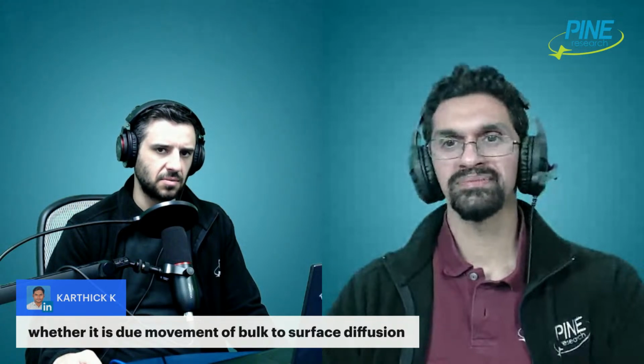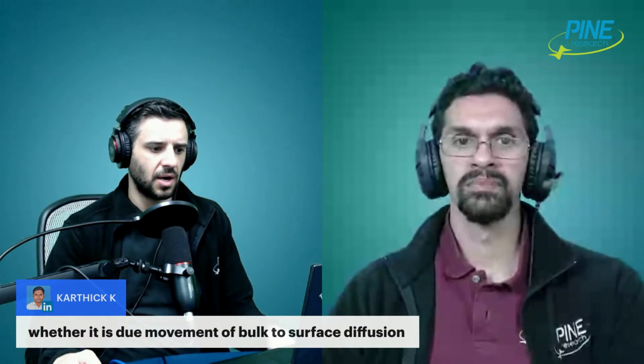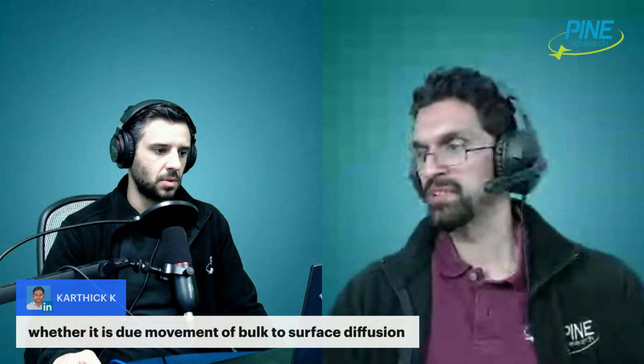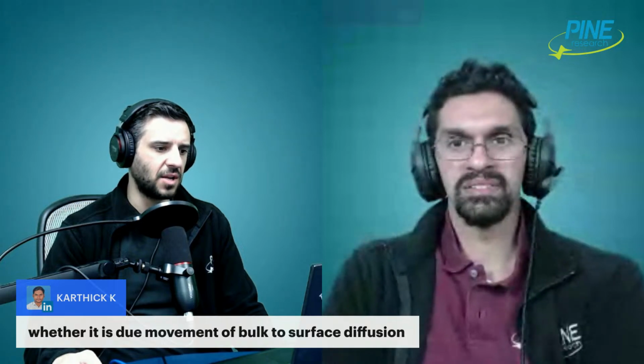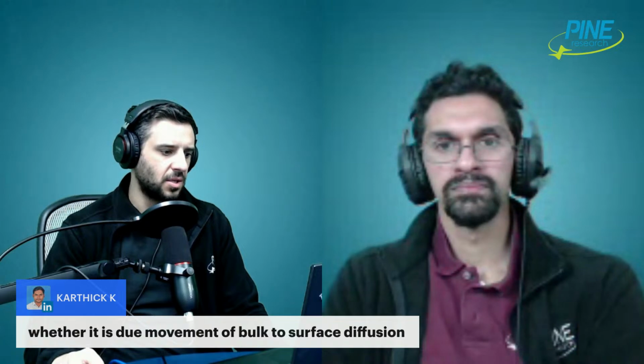Scanning slowly, you still would have diffusion. You're not going to not have diffusion. But if anything, it makes it a little bit worse because you may have vibrations that'll affect your signal. Yeah, like if you have a Faradaic process, you're still okay.